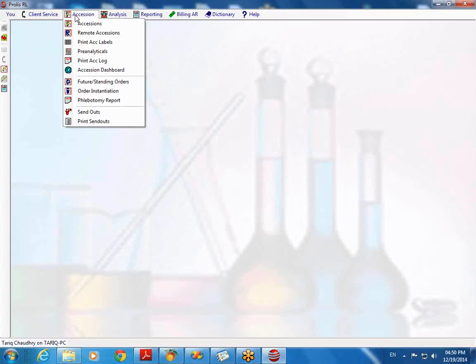Well, we do provide you that capability, but with some restrictions: you are not allowed to run any DDL on it. DDL will change the structure, and that will mess up the database. Yeah, of course. We would be just seeking read capabilities, we're only looking things up. Yes, reading capability is allowed. It is your data, your laboratory. Why would we restrict you? That works out.